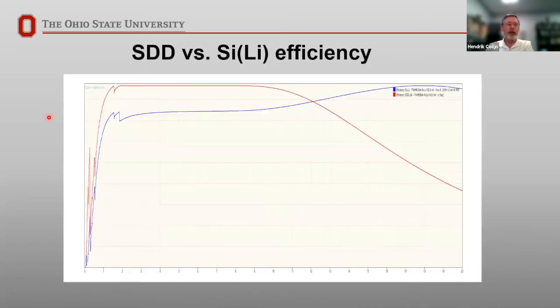Now, I mentioned that the detectors have their own efficiencies. The SDD is shown in this red curve, and the older Si(Li) detectors are shown in this blue curve. So this is a calculated efficiency. At about 10 kV, what you notice is the efficiency of an SDD starts going down. That's because the X-ray has high enough energy that it is penetrating the thin detector and going right through it without interacting. However, at the lower voltages, if you look carefully here, you see that the SDD has a higher efficiency than the Si(Li) detectors.